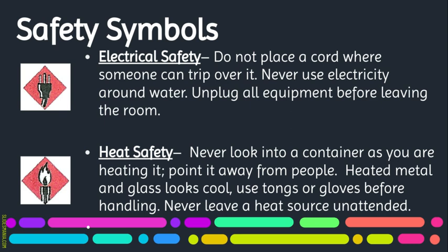Heated metal and glass looks cool. So if I were to heat a test tube, you would not see it get red. It would look just as if it was cool. And if you were to go and grab it with your hand, you'd burn your hands. So we always want to assume everything is hot and use tongs or gloves or heating pads because it's always better to be safe than sorry.